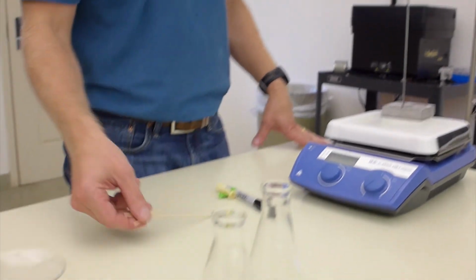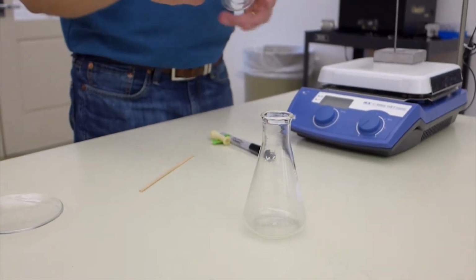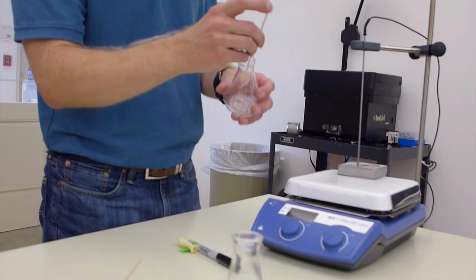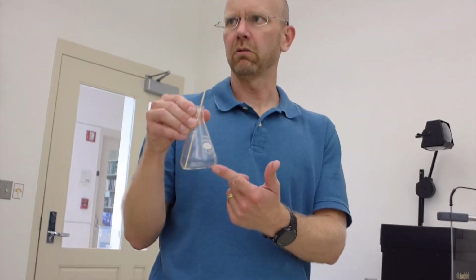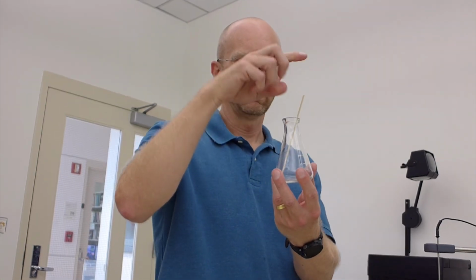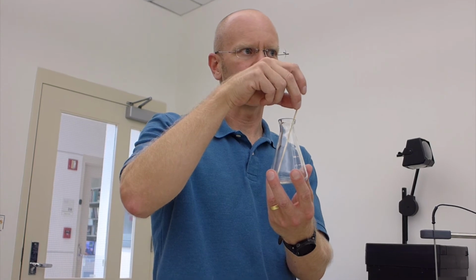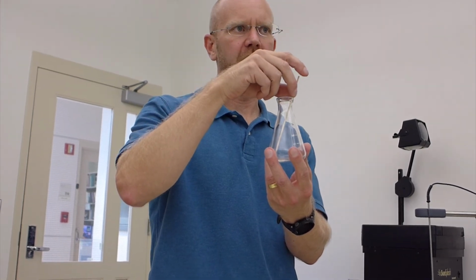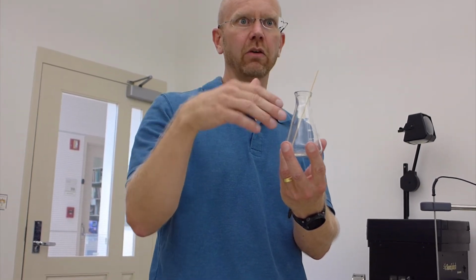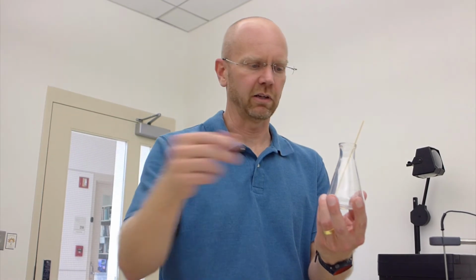Then you're going to want to make your saturated solution. And the way you do that is like this. You're going to get two Erlenmeyer flasks, and you're going to put in more solvent than you think you need for the recrystallization into one, and you're going to put in a boiling stick. Have you used boiling sticks before? Boiling sticks are absolutely essential for good recrystallization. These sticks will nucleate the bubbles in the solvent that you're using so they don't get superheated, and then when you stick your pipette in, they boil all over the place and they can start a fire and burn you, depending on the solvent.